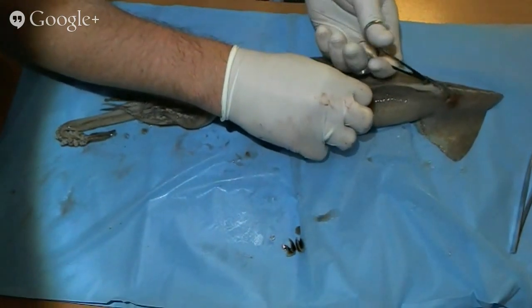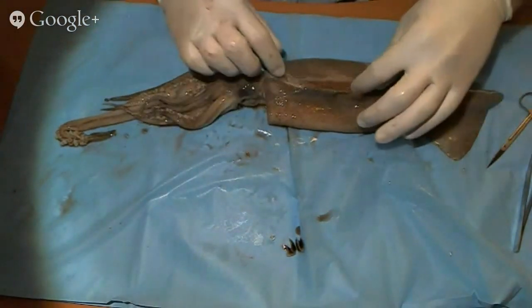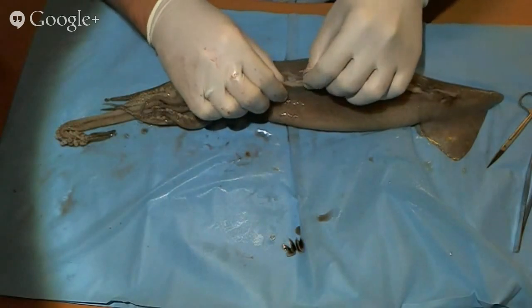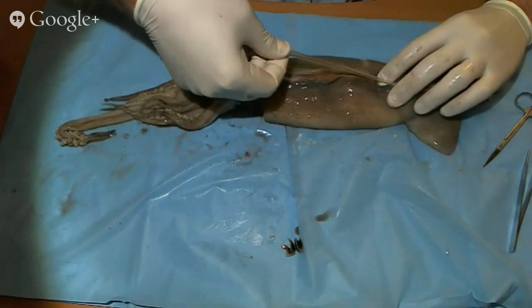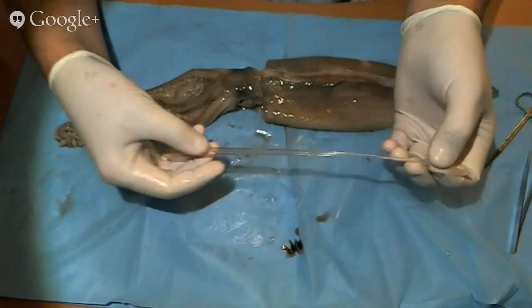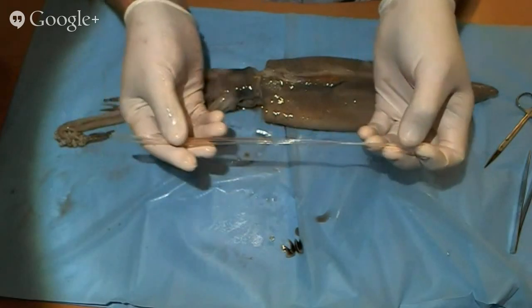And then what kids will find is right inside this mantle, they'll see a big piece of cartilage, which has been called the pen of a squid. The pen of a squid is a large cartilaginous backbone-like structure.